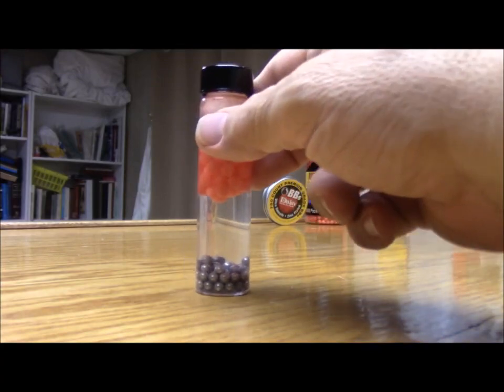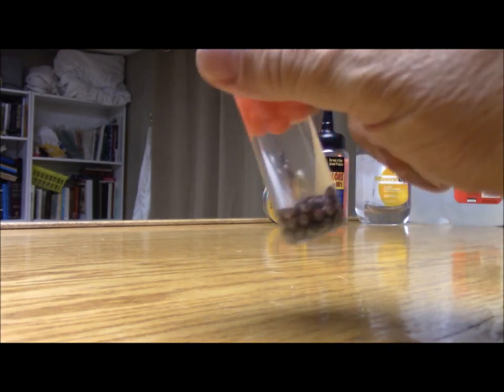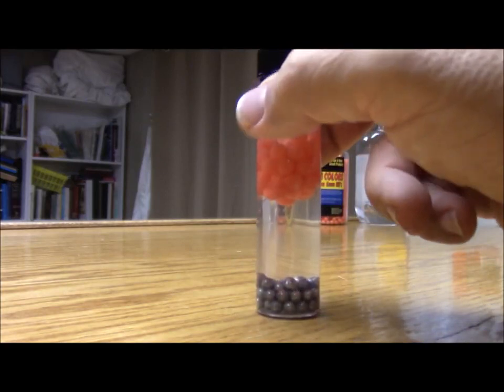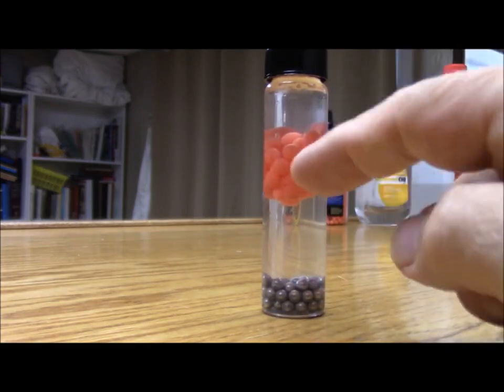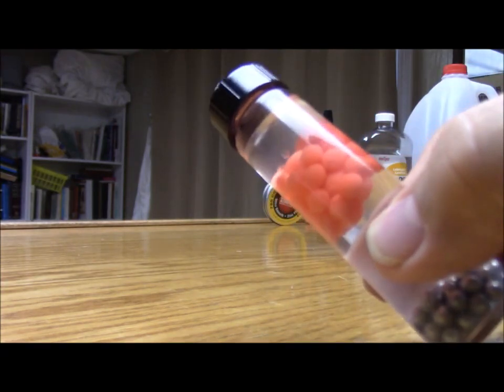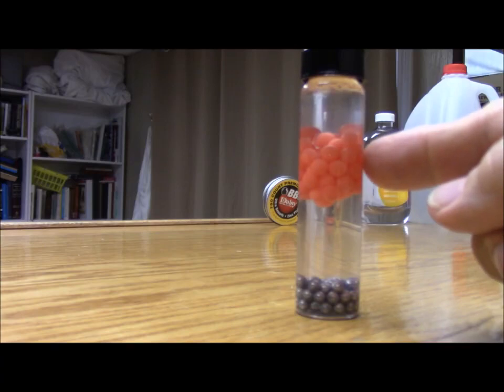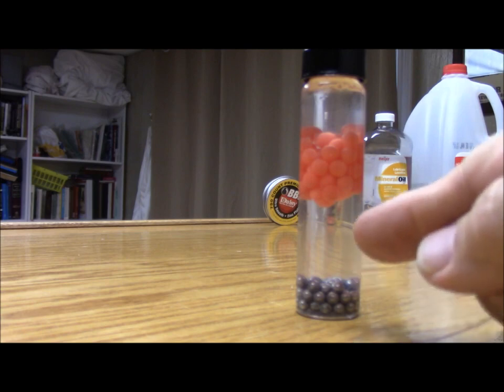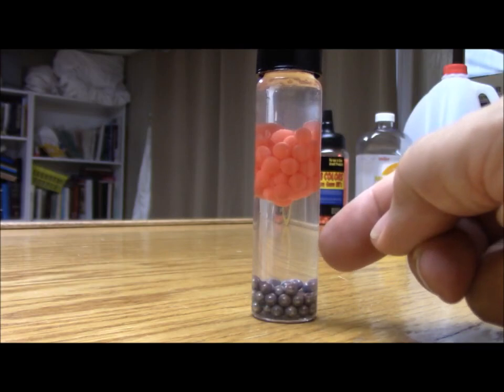So let me see if I can pull it a little closer and get a better look at it. Okay, you see there's something round and metallic looking in the bottom. Then we have this clear liquid, and then we have these orange spheres here. They're a little bit bigger than the steel ones on the bottom. These are made of plastic. And then at the top is another clear liquid. So this clear liquid here is different than this clear liquid at the top. Otherwise, they would be together.